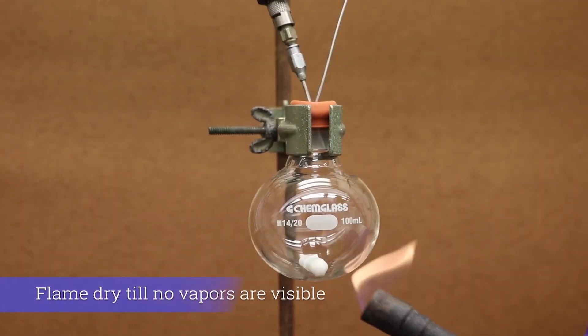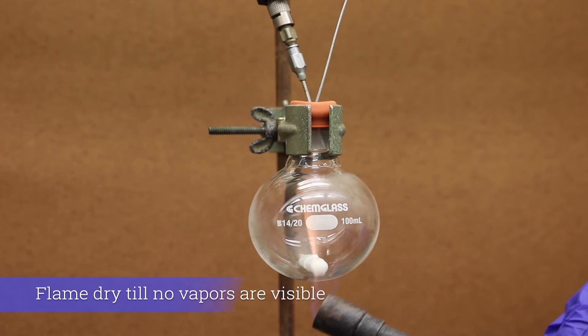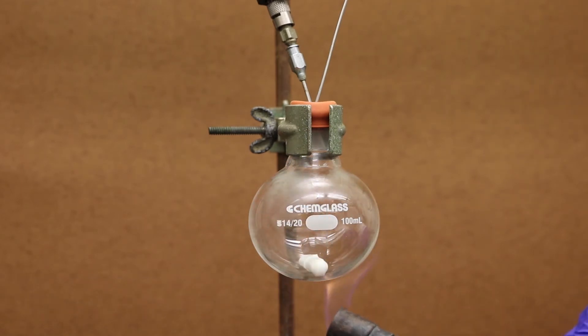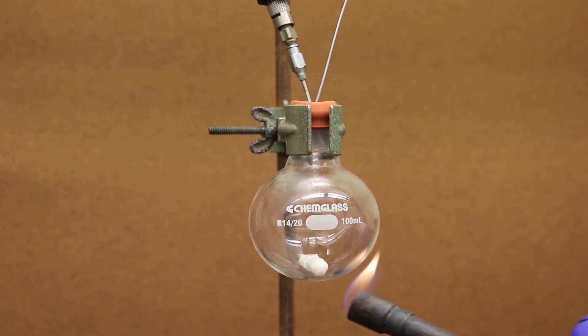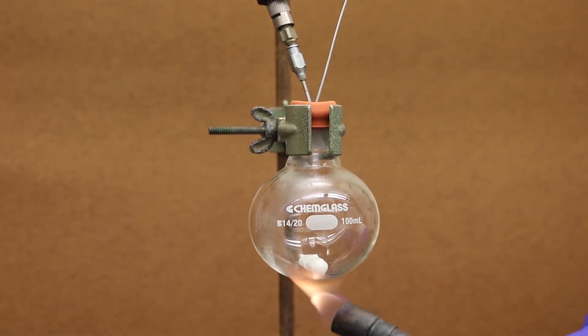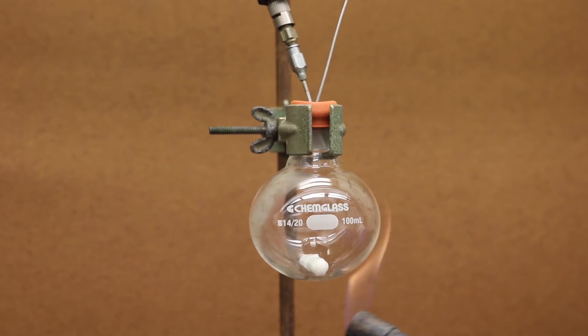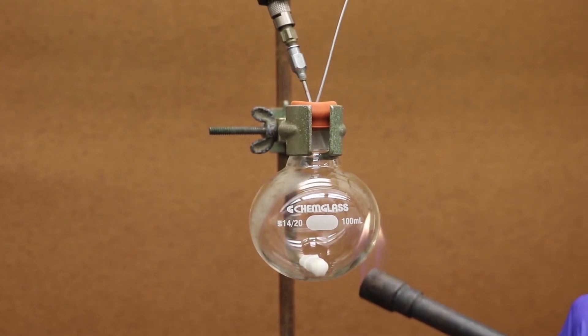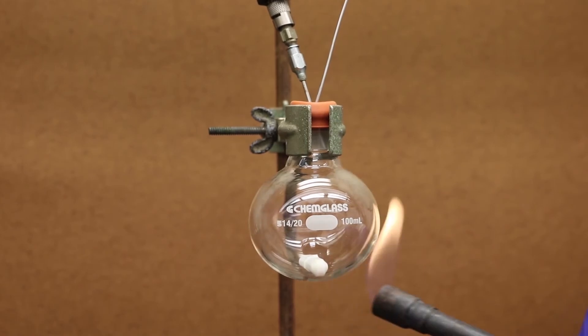When flame drying, make sure the flame color is yellow. Heat the round bottom flask evenly until all of the vapor subsides. Be sure to move your hands constantly in order to avoid burning the magnetic stir bar, and keep the flame away from the rubber septum and clamp, especially if the clamp has a rubber coating. Therefore, it is suggested to use a metal clamp to avoid burning any rubber.